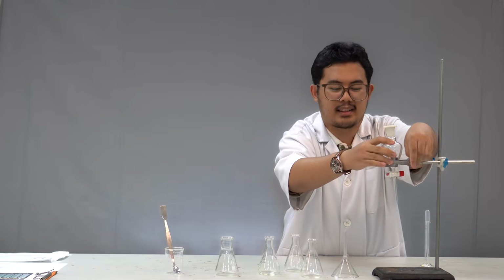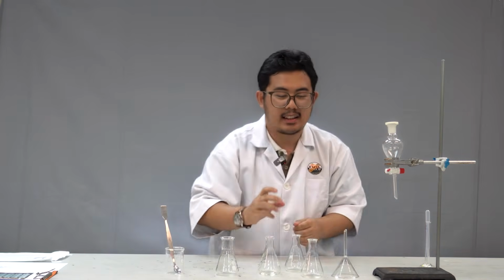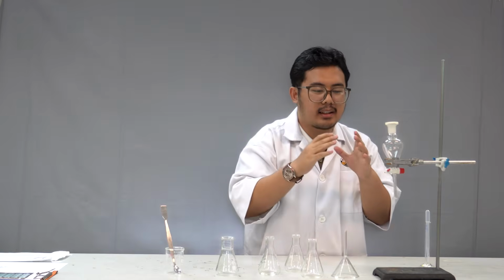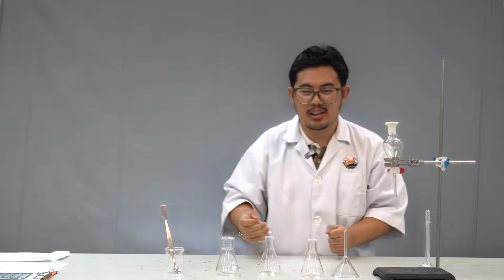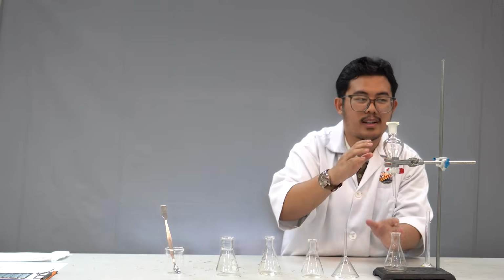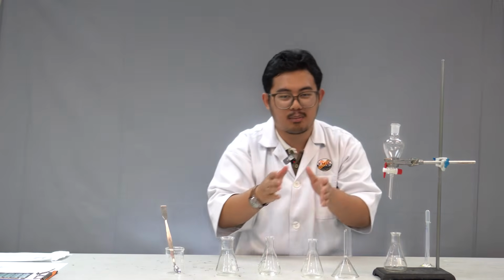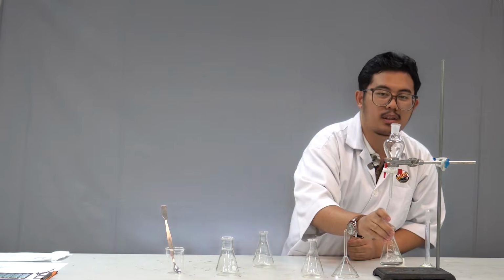So just like the acid, to separate this, we have 2 layers. In this case, the top layer is the base and the bottom layer is the neutral. The top layer being pure base and the bottom layer being neutral with a bit of base. So again, using the mixture conical flask, we extract first the mixture out, making sure all the bottom layer is poured out, and again take off the cap, make sure all the bottom layer is poured out, and continue on with all the leftovers with base.